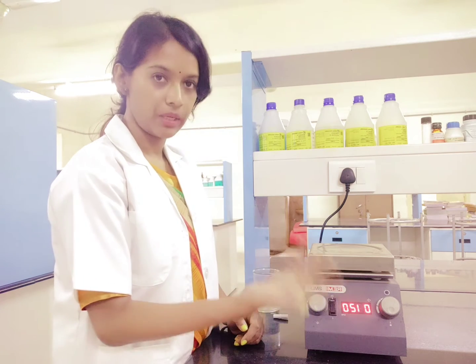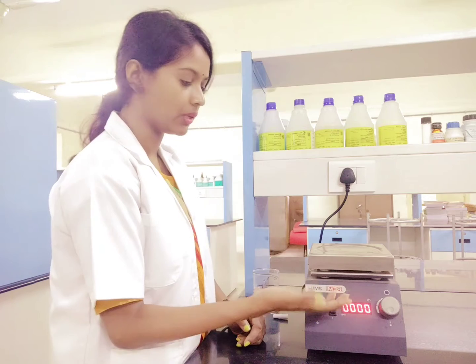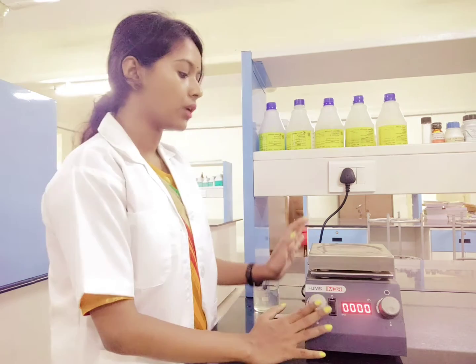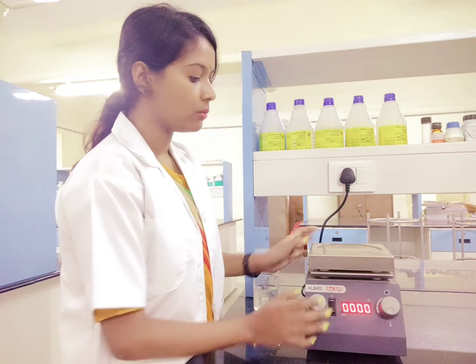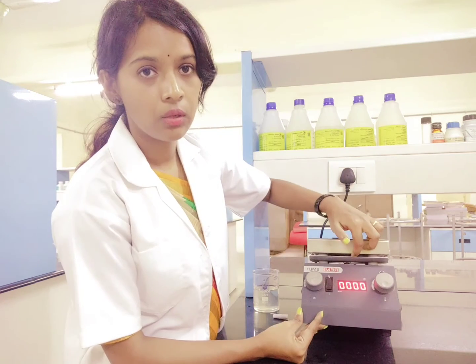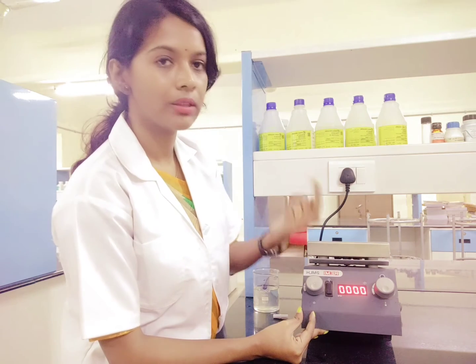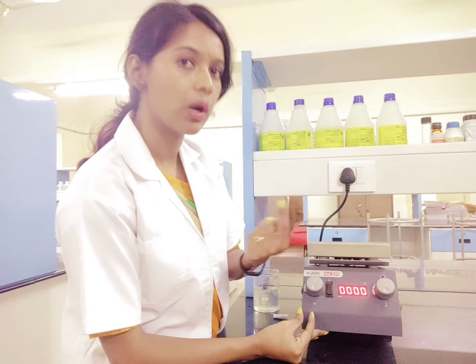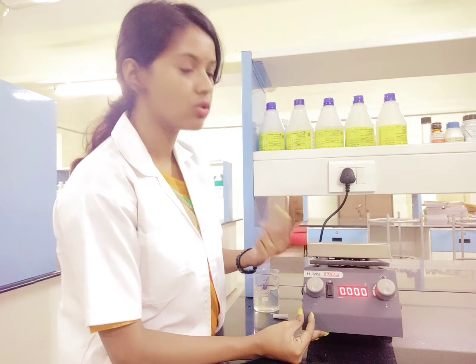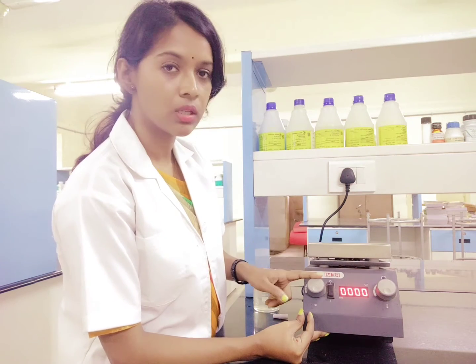Now, what is the thing whose speed can be increased? Since it is a magnetic stirrer, there will be a magnet bar. In this instrument, along with the motor, one shaft is attached, and that shaft is a magnet bar. Once you turn it on, that keeps on rotating. When it completes one rotation in one minute, the speed is one RPM, and how many rotations it takes in one minute is controlled with this speed controller.